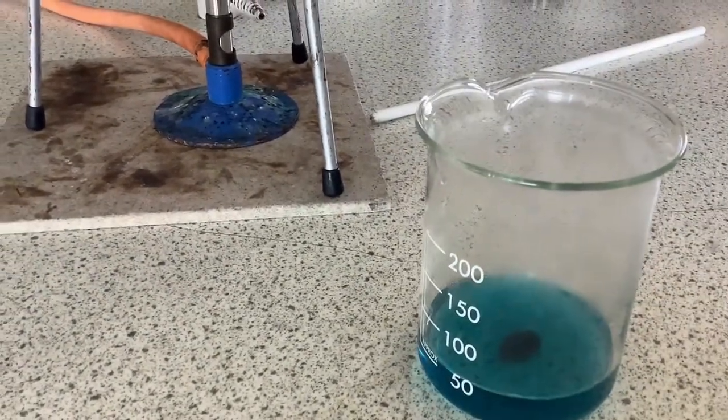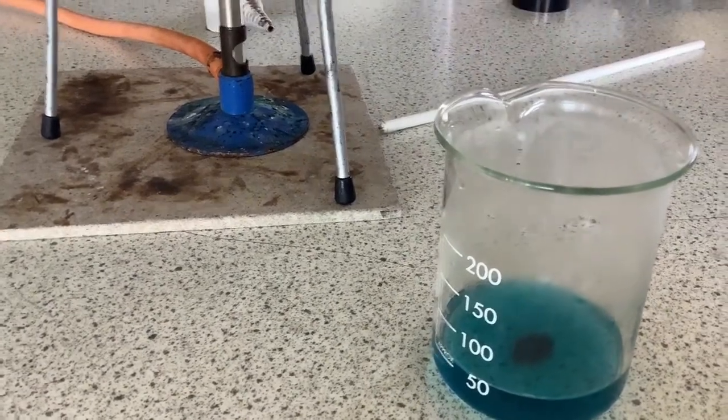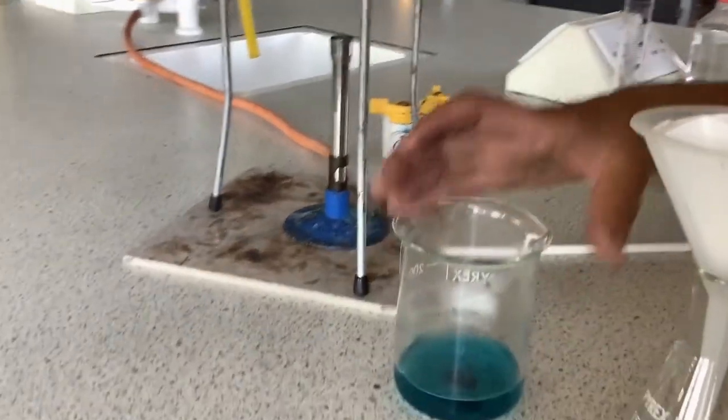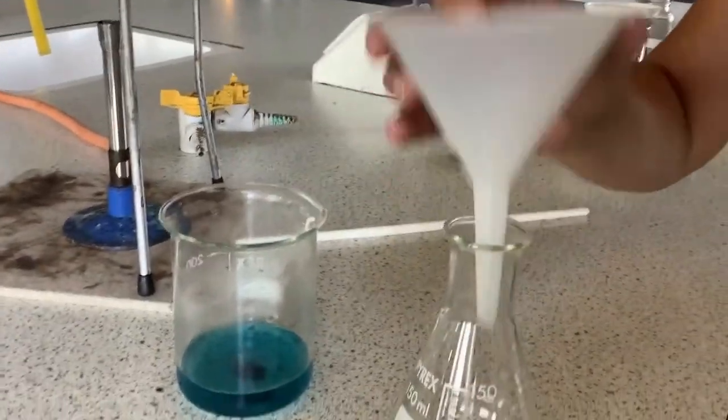We now need to remove this excess, and we do this by filtering using a filter paper and a funnel.